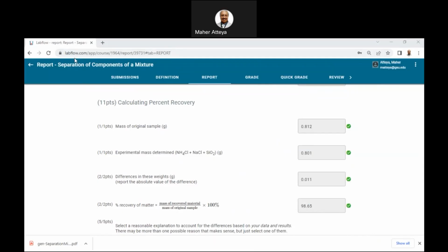Yes, this is good. Copy. I'm pasting this one here. Paste.